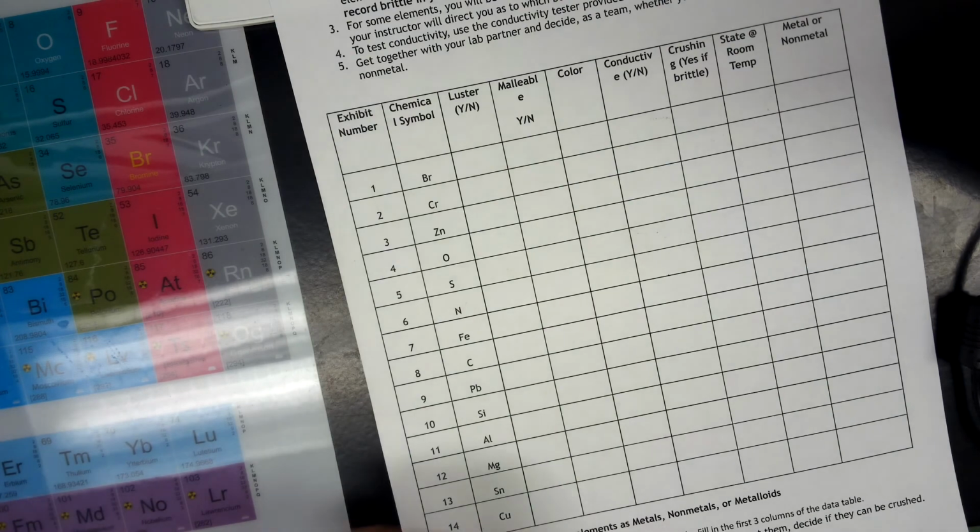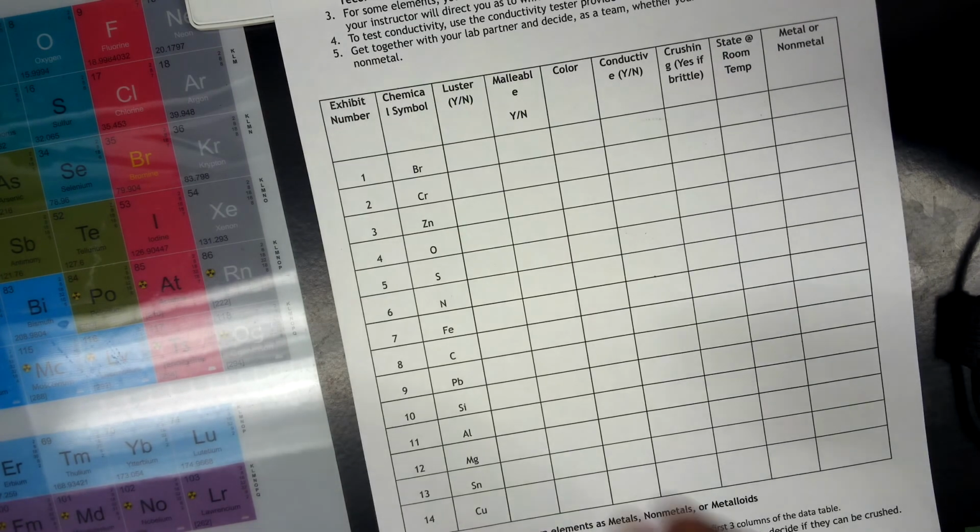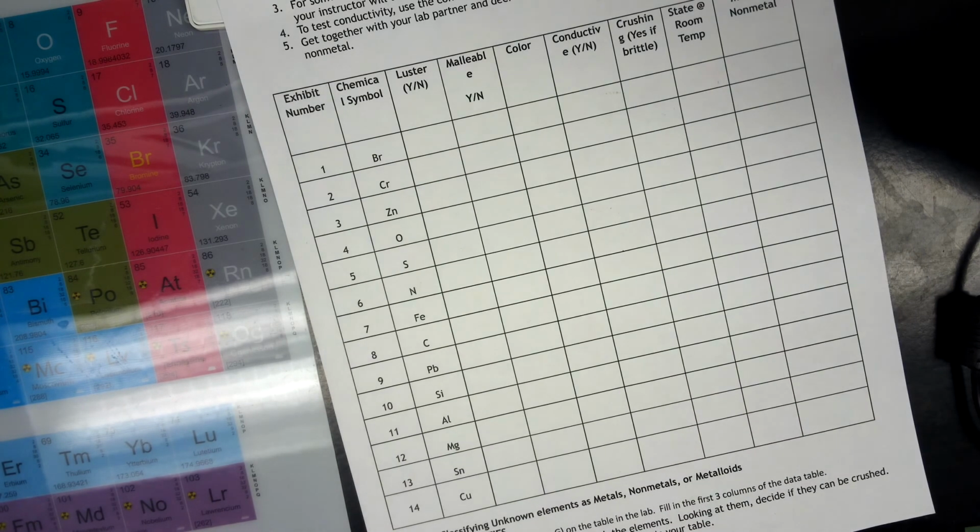I got my periodic table over here to help us out. We're not going to look at this whole list, but we're going to look at quite a few of them, just because it's one of our cooler labs that we get to play around with some of the elements from the periodic table. With that being said, let's dive into some of this stuff.